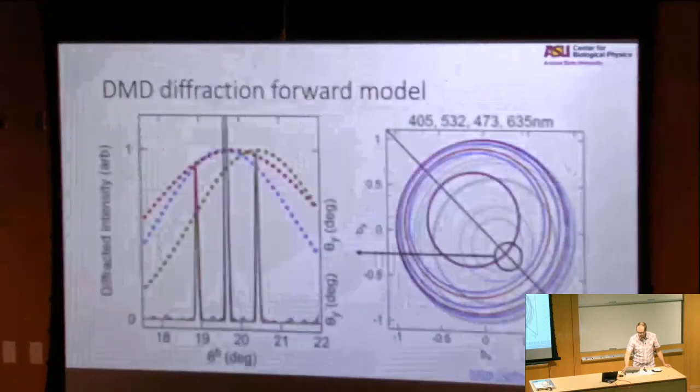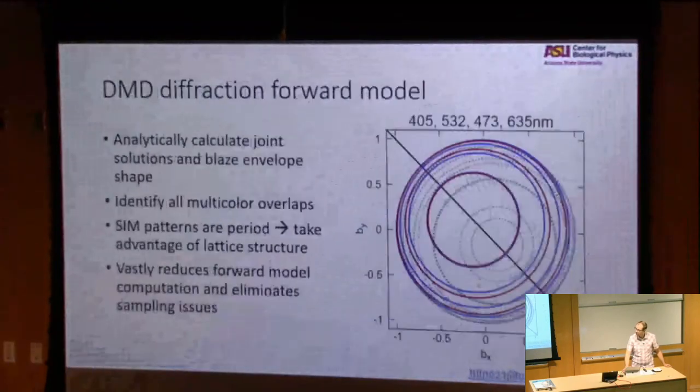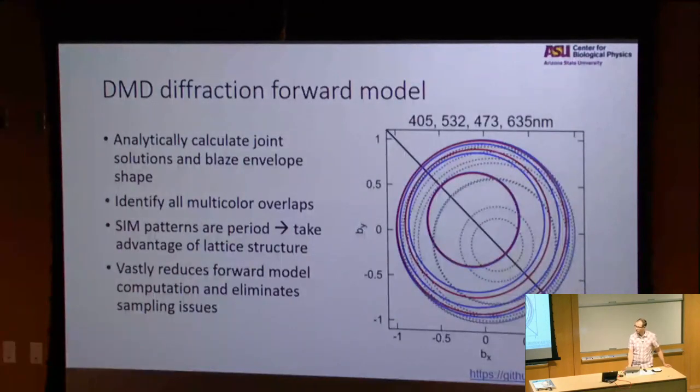So when we're calibrating it, that is definitely an assumption we make, that we have a very, very thin, highly absorptive layer of fluorophores. For the analysis, for the real experiments, the answer is no, we don't have to make that assumption. So what breaks down when you don't make that assumption?